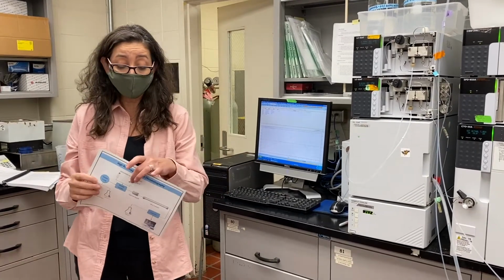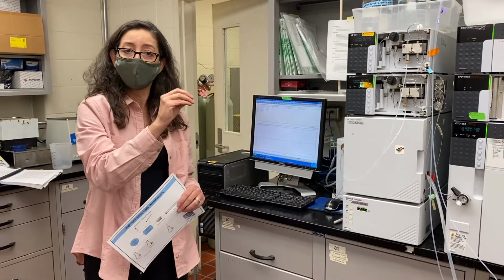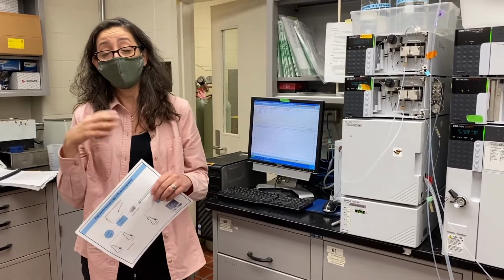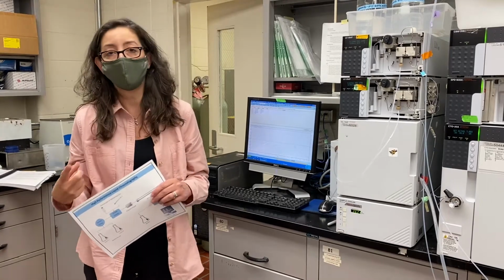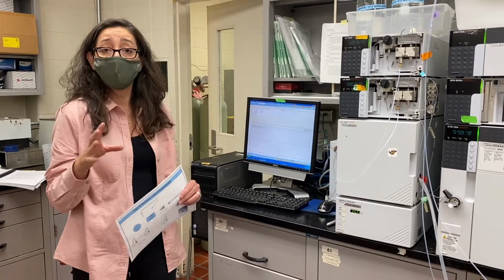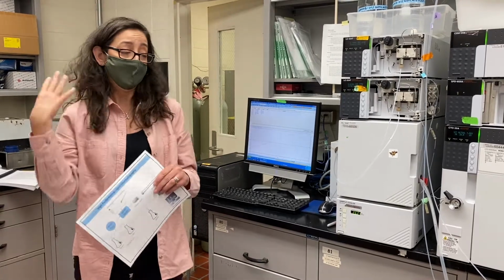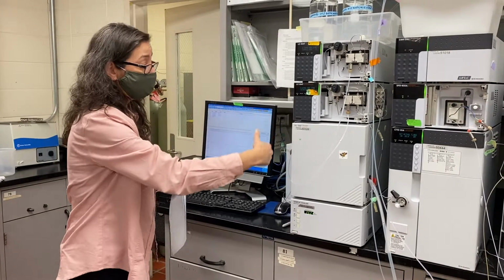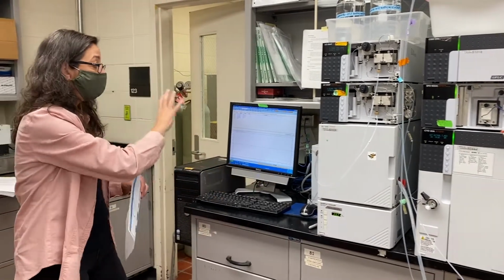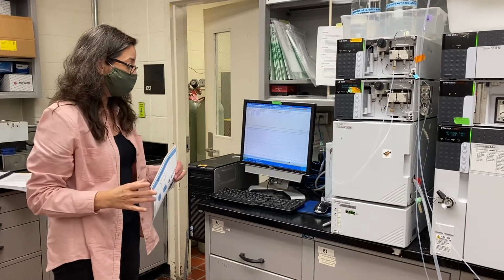So what you will be doing in the lab, you will be preparing your samples in the teaching lab, and Fan, your TA, will be running them on the HPLC for you and giving you the data. So today what I'm going to do is show you the parts of the HPLC, show you how we do manual injection versus auto injection, and then show you the chromatogram and how we integrate the data.